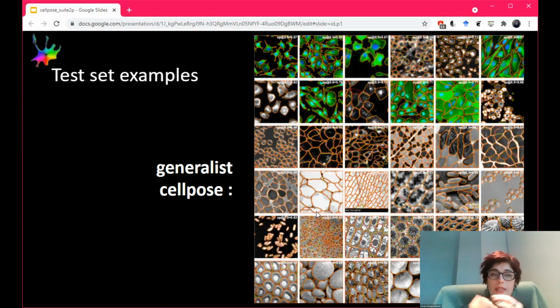Another thing I should have said, I'm sorry, is that when we're training this cell model, for some images we have a nuclear channel. So you see this blue with this green, and we put that into the model. For many cells we don't have a nuclear channel, but for the ones that we do, we put in that nuclear channel, and that can help in ambiguous cases. Knowing the nuclear information can improve the segmentation. So it's been trained for cells where we do have a separate nuclear channel with that channel input.